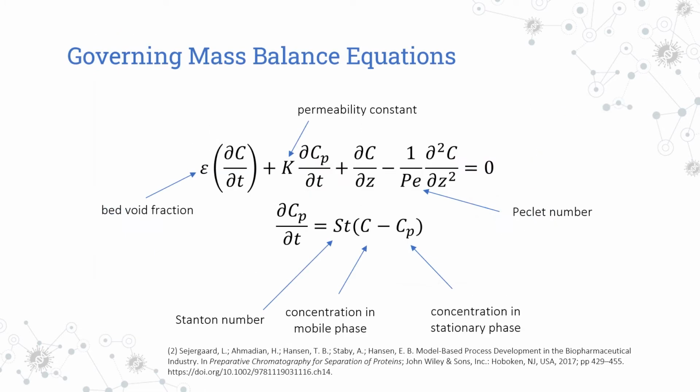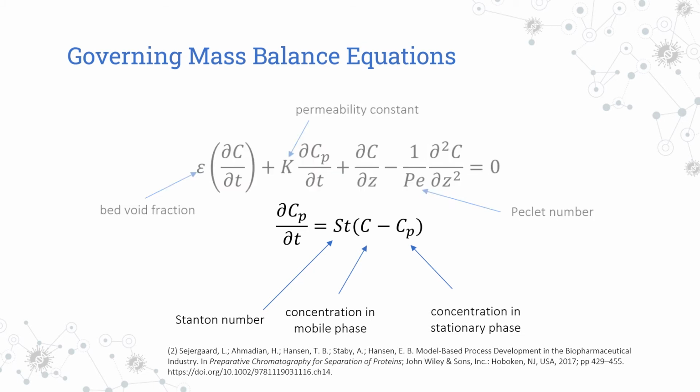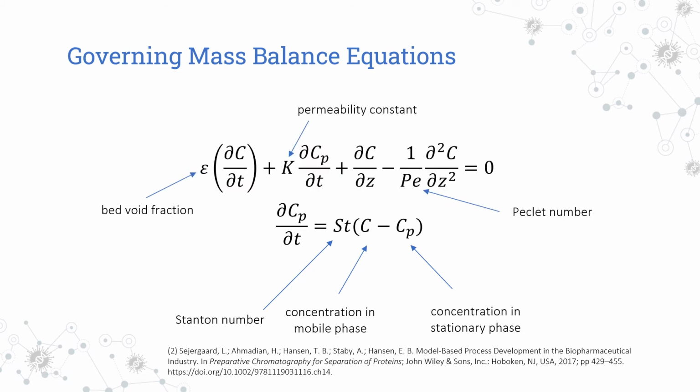The SEC unit can be modeled based on the governing mass balance equations that result in a system of partial differential equations. This system allows us to model the concentration of the impurities with respect to position and time. Specifically, it looks at the concentration within the mobile phase as well as the concentration within the stationary phase.